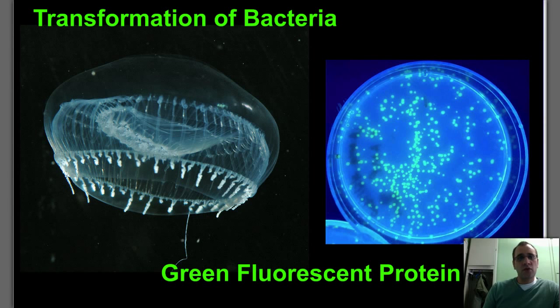Hi everyone, I want to walk you through the steps we used in the Transformation of Bacteria lab as a review exercise. This is one of the concepts you really want to know well for the test that's coming up. So let's start with this.